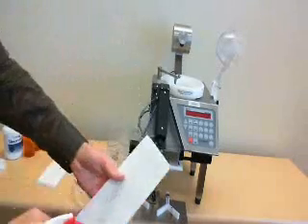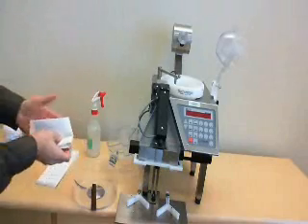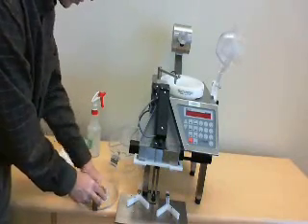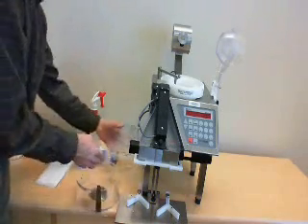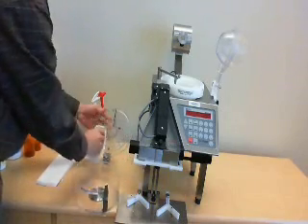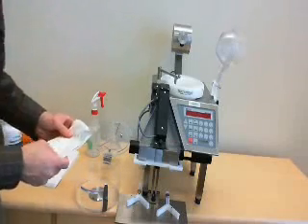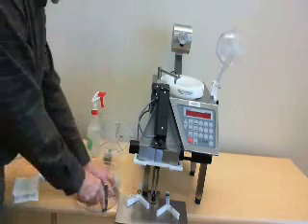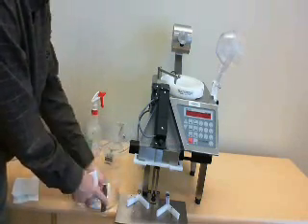We recommend spraying onto a towel versus directly in. You're able to control the amount of cleaning solution you're using. For the purpose of brevity, I will make a relatively quick clean off of this. But you're going to want to get all surfaces that touch medications, and then use a dry towel or dry cloth afterwards to ensure that there's no moisture or residue.